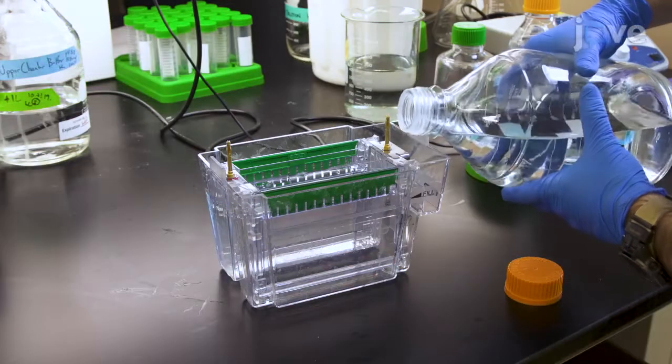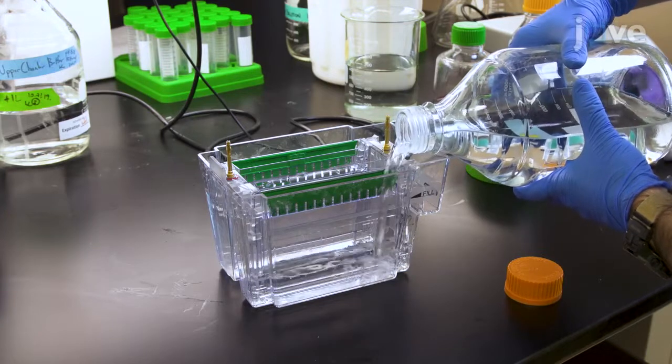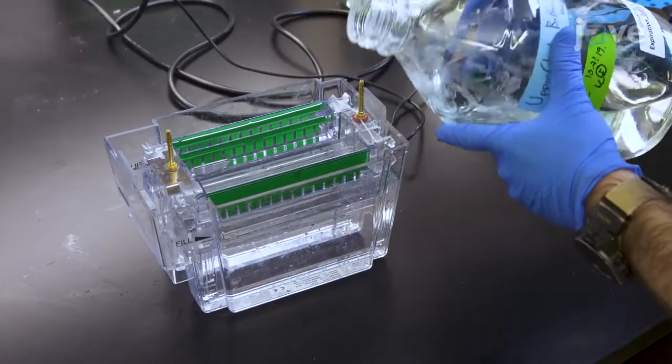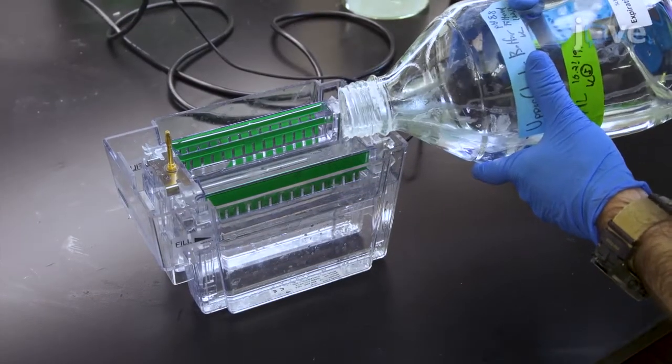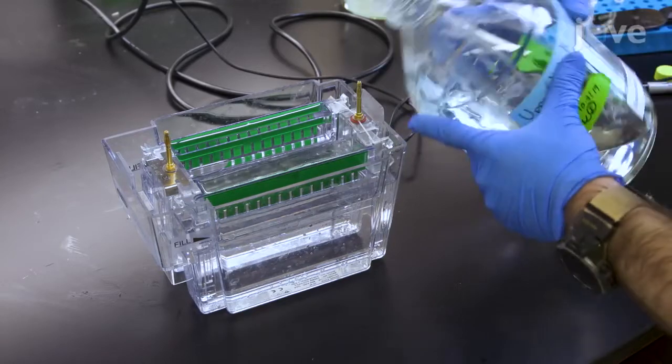This technique is readily adaptable to most life science laboratories. Comparable glycomic techniques often require equipment and expertise only found in glycochemistry research laboratories.